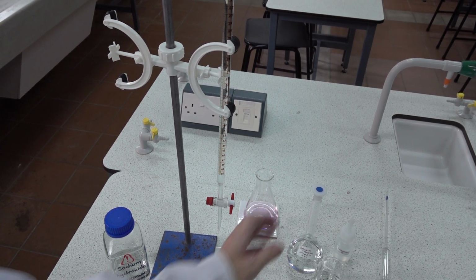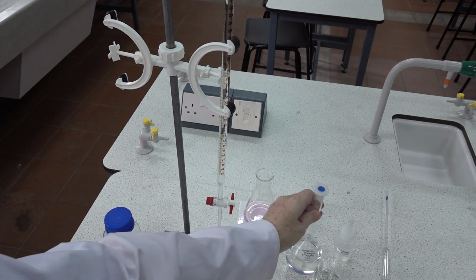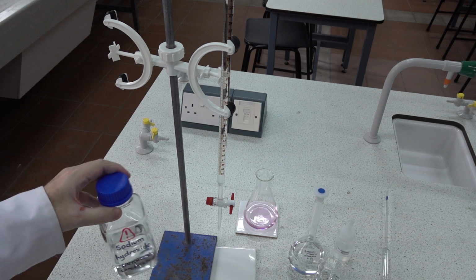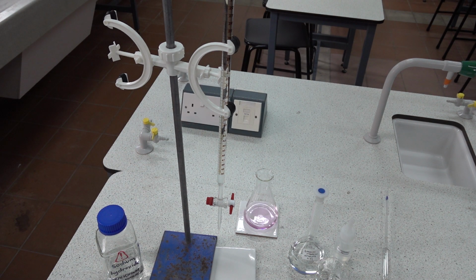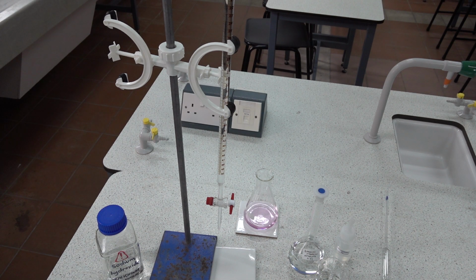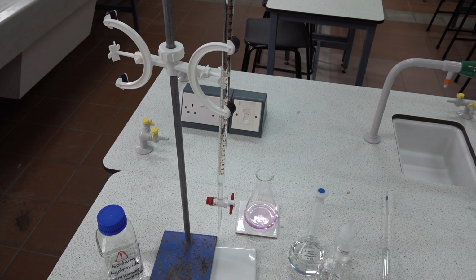In this titration, we're going to use our standard solution of potassium hydrogen phthalate to determine the concentration of a solution of sodium hydroxide. In this setup, the sodium hydroxide is in the burette because we're using a phenolphthalein indicator, which turns pink in alkaline solutions. This is our rangefinder titration that we've already carried out.